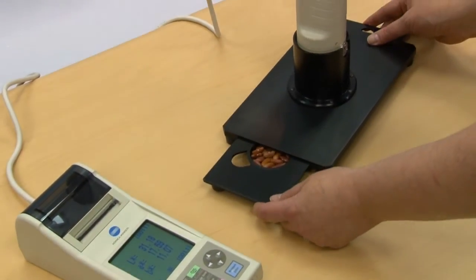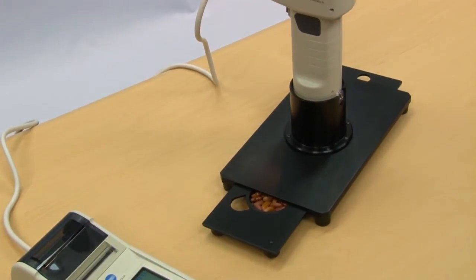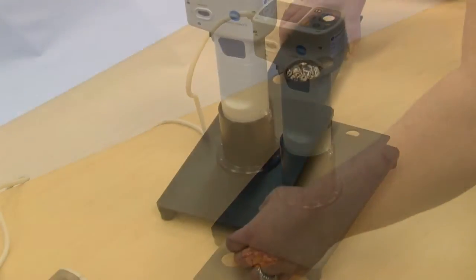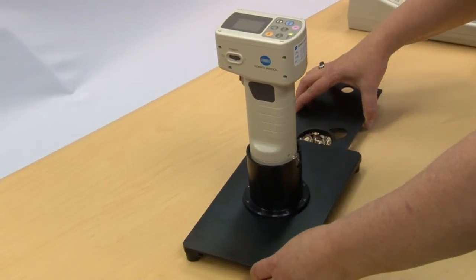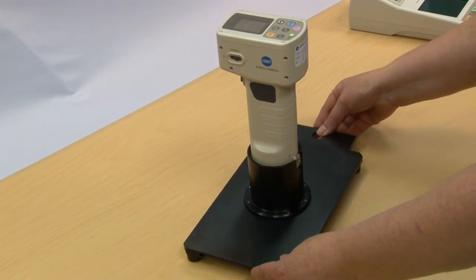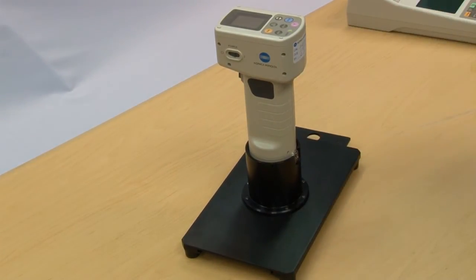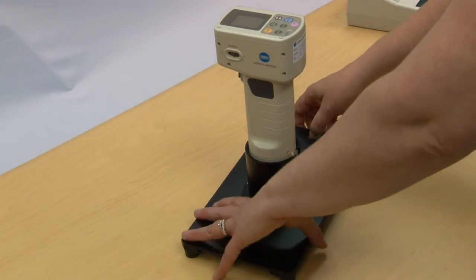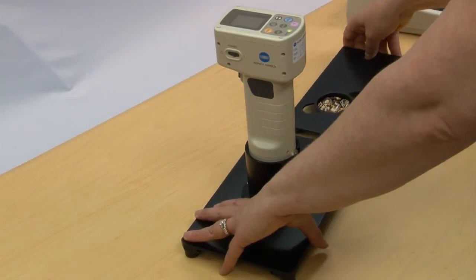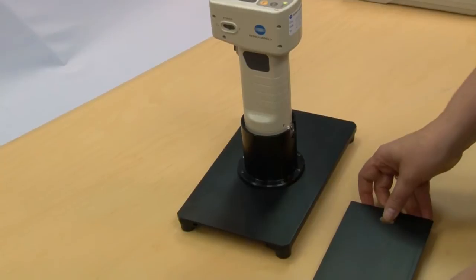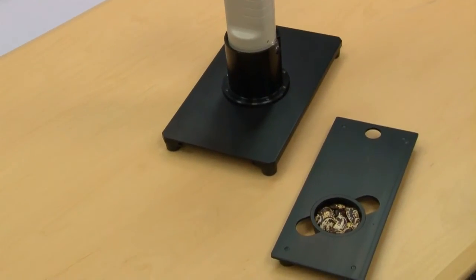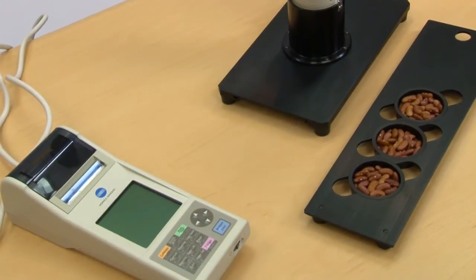The CR410 sample holder provides a stable base that can be used with the data processor or in standalone mode. The sample holder enables the instrument to be held in a consistent position to the sample that is placed in the cup, which is held in the sliding tray. The tray slides into the precise location by using detents. Additional cups can be purchased.